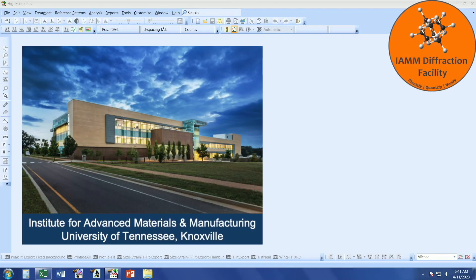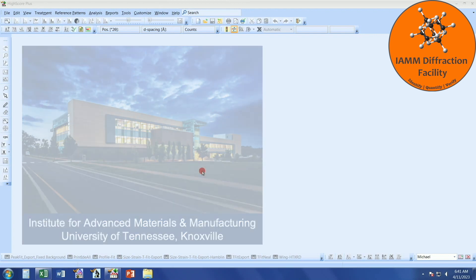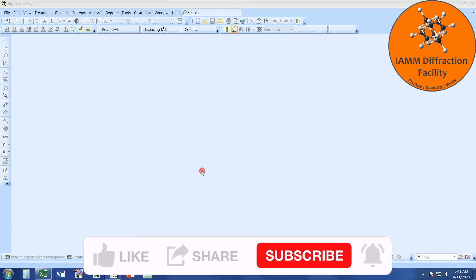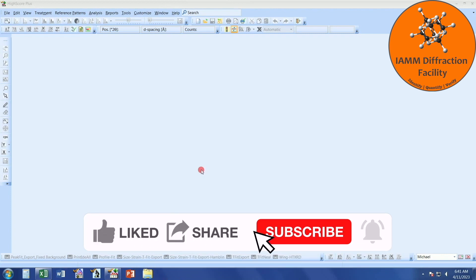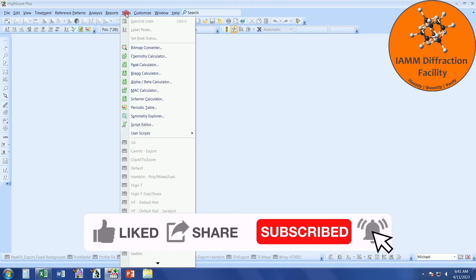Hello, my name is Michael Kaler, and I am the lab manager of the IAM Diffraction Facility located at the University of Tennessee, Knoxville. In order to determine the penetration depth of x-rays, we can go to Highscore Plus and use Tools and MAC Calculator.